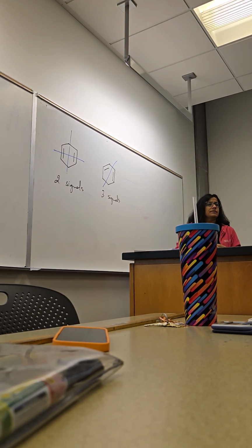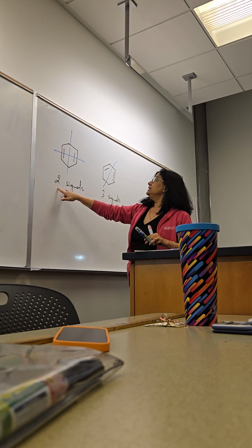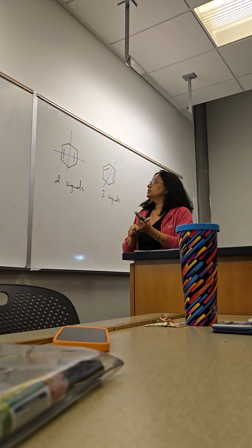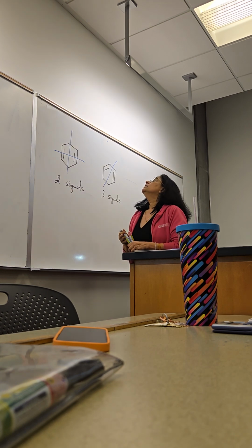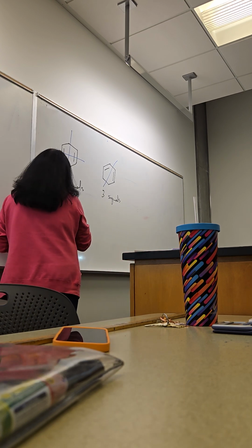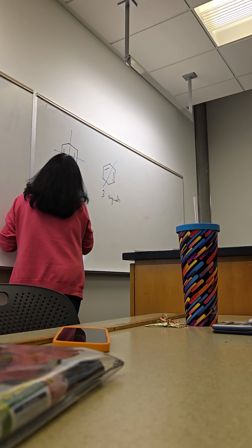Yes. Yeah. Question, Vincent? No? Okay. What about the integrations for those 2 signals? What do we expect for the integration to be? 2 to 1. Excuse me, did you say 2 to 1? Yeah.